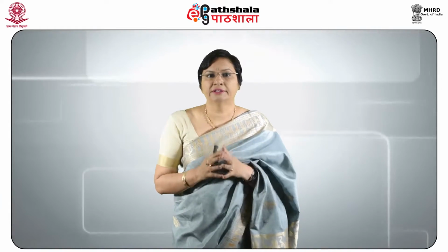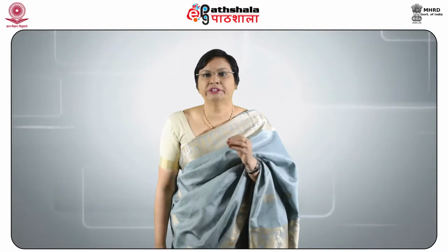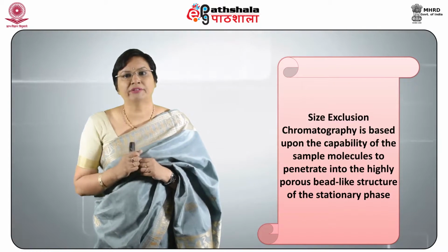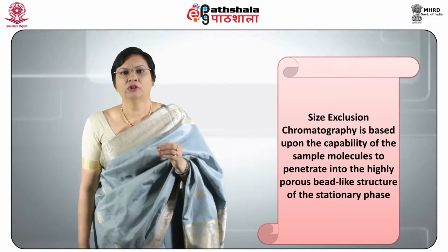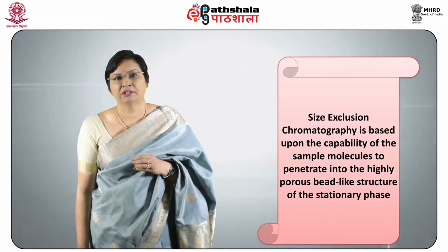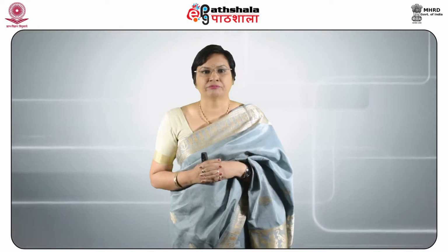To attain this, stationary phases hold pores through which compounds are able to diffuse to a certain extent. Size exclusion chromatography is based upon the capability of the sample molecules to penetrate into highly porous bead-like structures of the stationary phase. Separation occurs only as a result of the different degrees of penetration.